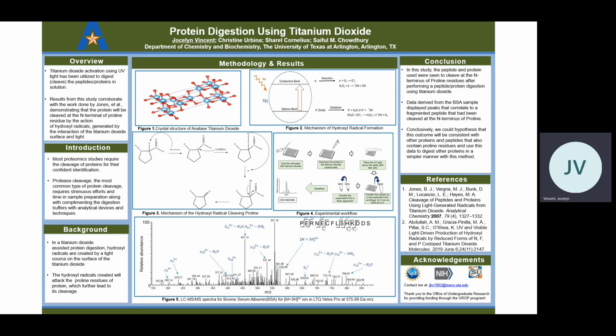I currently am working in Dr. Chowdhury's research group, and I will be discussing protein digestion using titanium dioxide. First, I will discuss why we perform protein digestion. Protein digestions are performed to break a protein into peptides that are easier to analyze. Proteases are used to digest proteins, and the most common protease is trypsin.